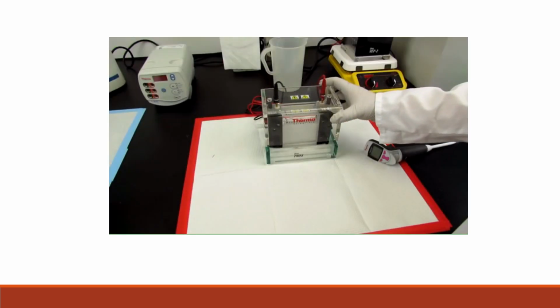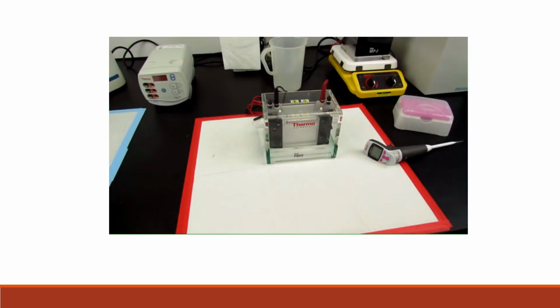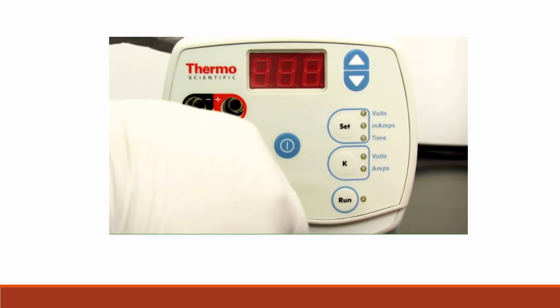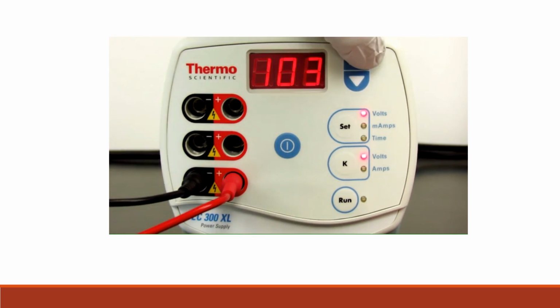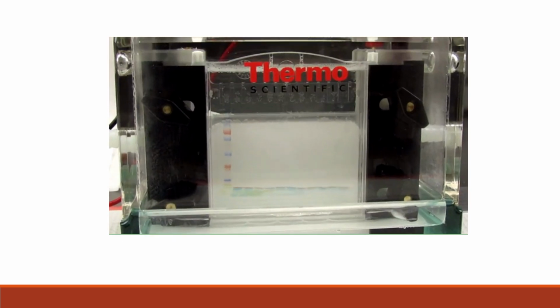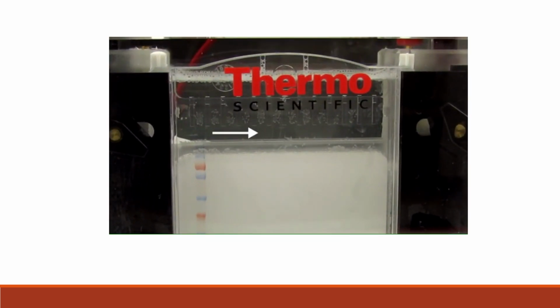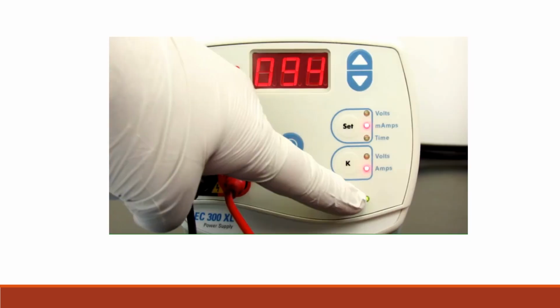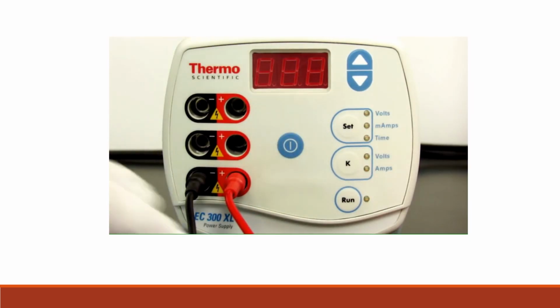Once the samples and marker are loaded, connect the electrophoresis unit to a power source, making sure that the cables are correctly connected to ensure correct protein migration. Then apply an electric field at the appropriate voltage or current, which depends on the type and number of gels being used. Bubbles appearing around the cathode indicate that the current is flowing. Once the dye front reaches the bottom of the gel, turn the power off and unplug the cables from the power source.